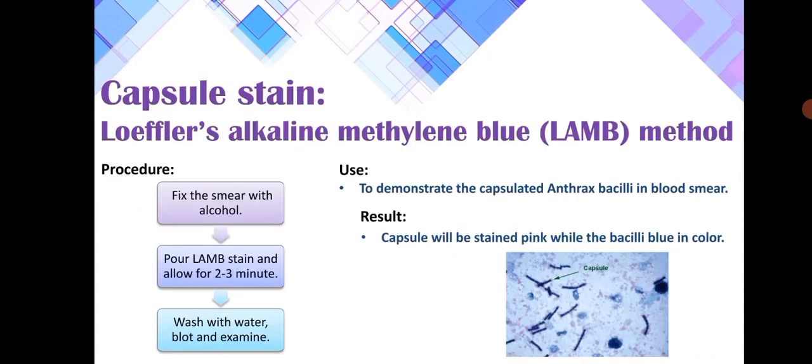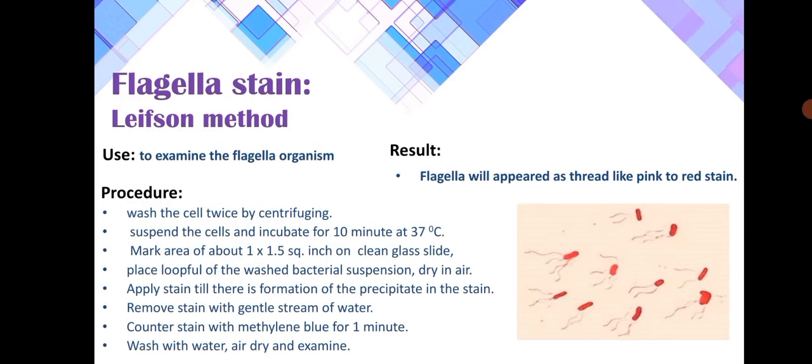Loeffler alkaline methylene blue staining method is for capsule staining. It is used to demonstrate the capsulated anthrax bacilli in blood smear. The capsule will be stained pink while the bacilli will be stained blue in color. Leifson method is a method of staining flagella and it is used to examine flagellated organisms. The result is that the flagella will appear as a thread-like pink to red stain.